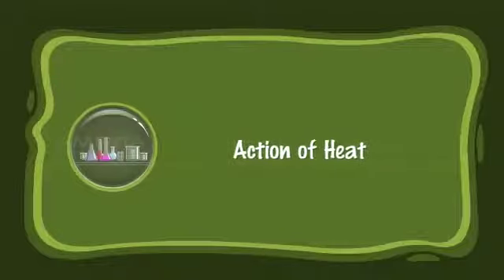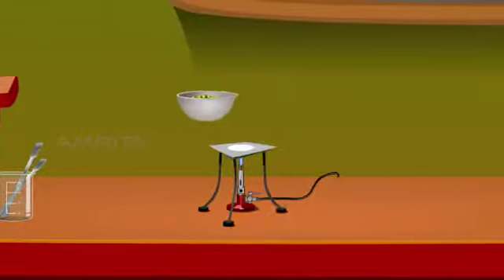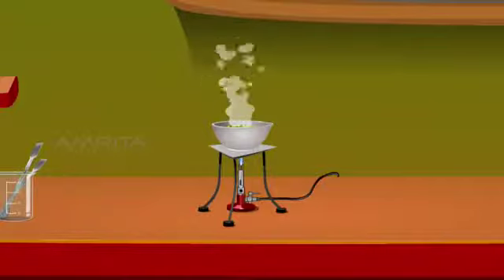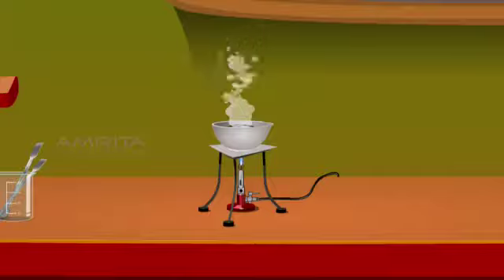Action of heat. Take a small quantity of mixture A in a china dish. Heat the mixture strongly. A black mass is obtained which is homogeneous. A compound of iron filings and sulfur powder, FeS, is formed on heating.